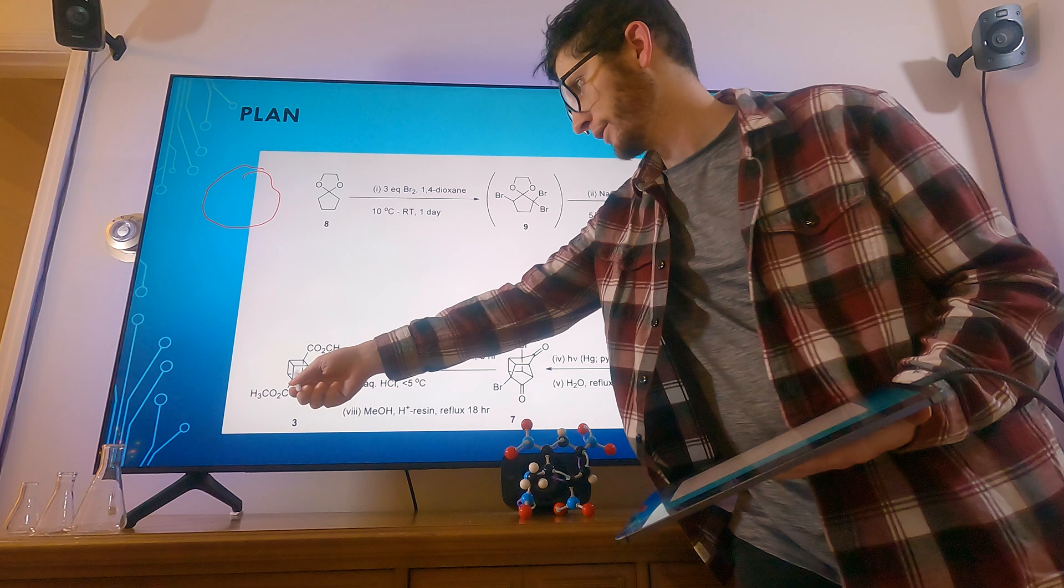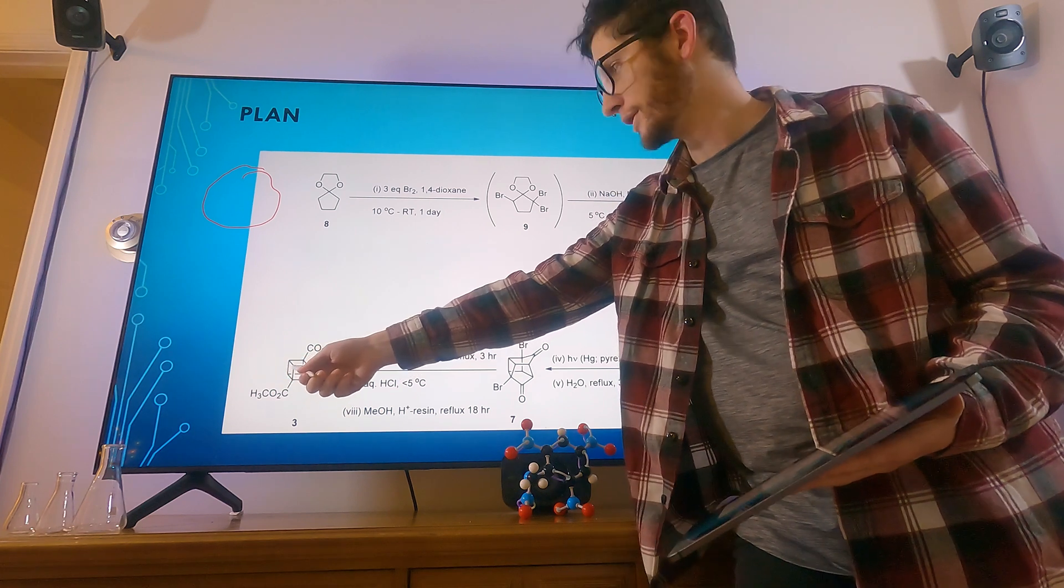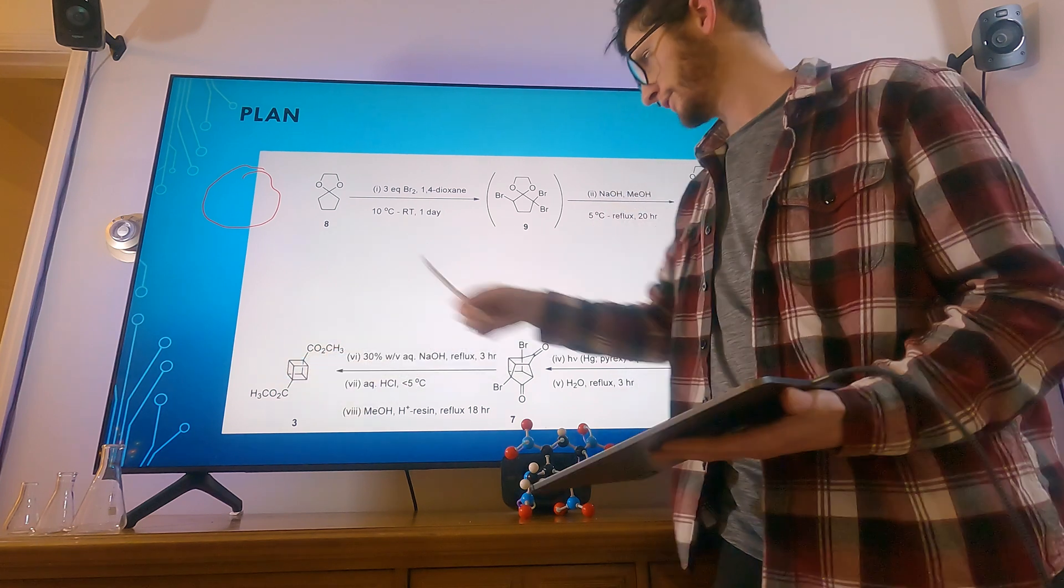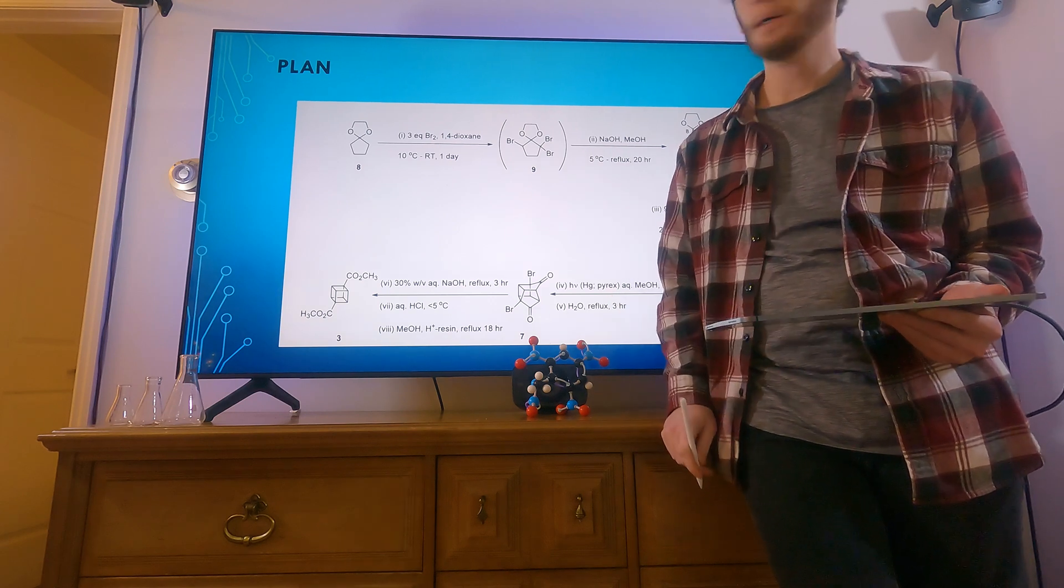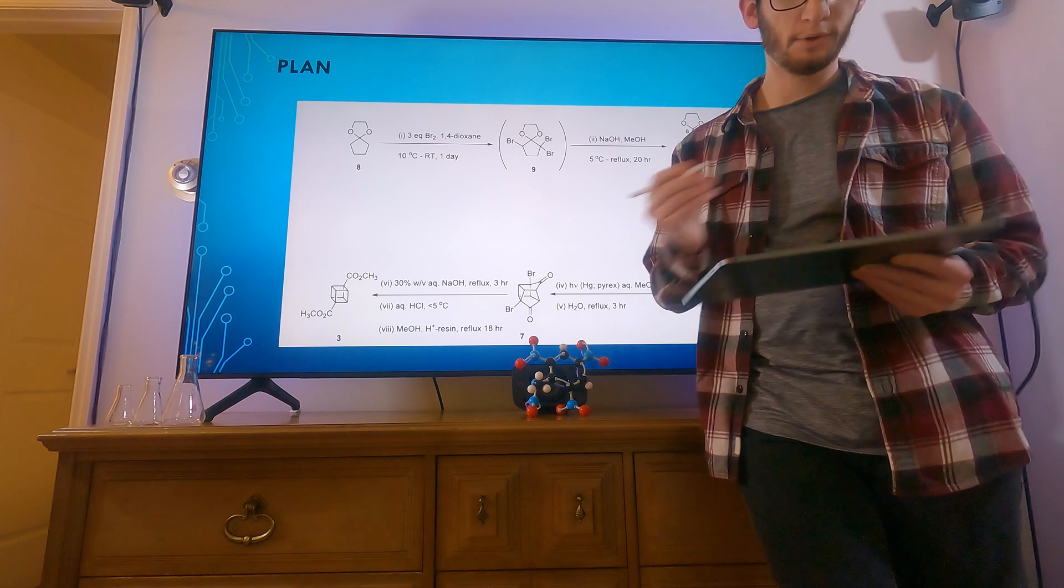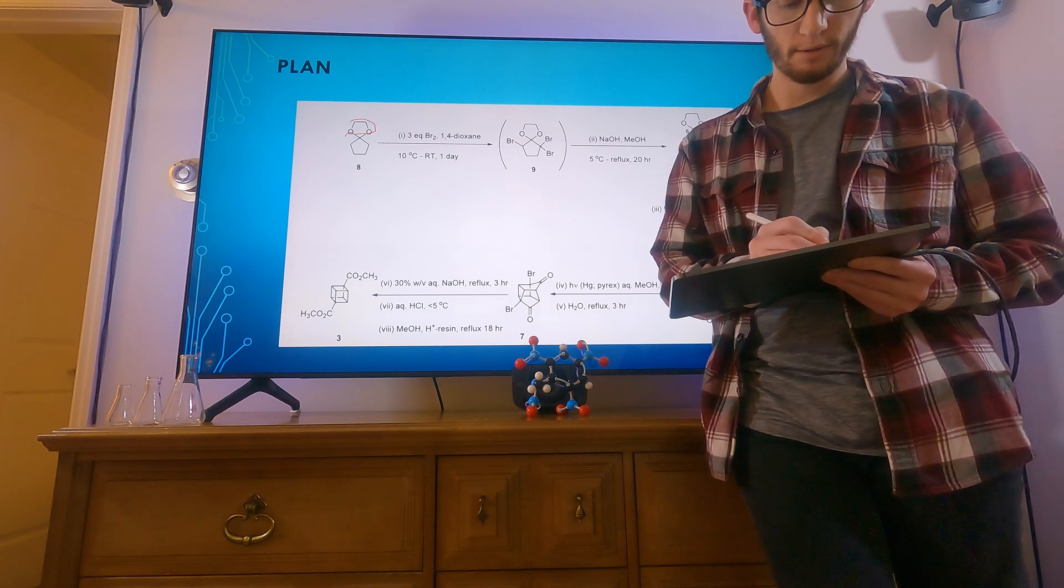However, first we're going to go to here, just as a proof of concept, can we do this? So we'll do a bunch of smaller procedures throughout the plan. We need to make all of the starting materials. We already made the ethylene glycol here.